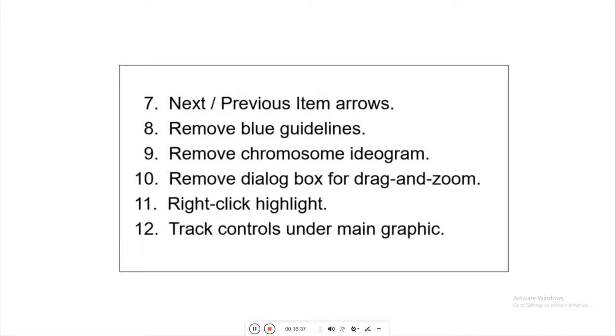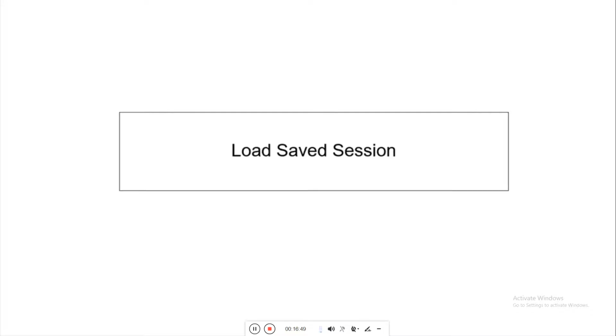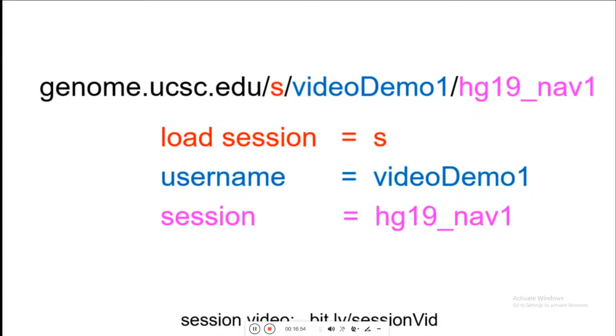At the end of part 1, we found ourselves on chromosome 11, with several datasets turned on. To make it easy to find that location again, we have saved the configuration for easy access. The Saved Sessions feature is the subject of a separate video in the UCSC browser video collection, so it will not be presented here.